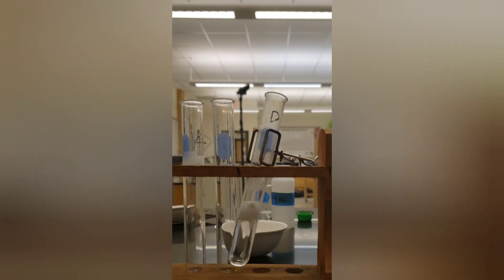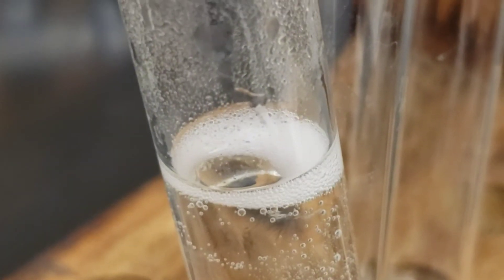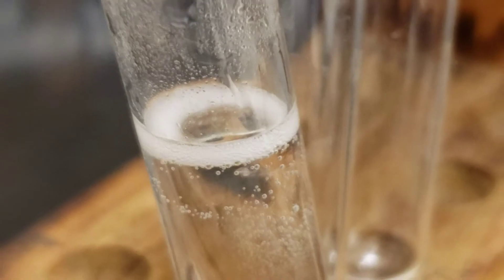For this reaction, you can just let it proceed until the magnesium is fully reacted away. And as you can see here, the magnesium will eventually just be fully reacted away and gone as the bubbles slowly calm down.